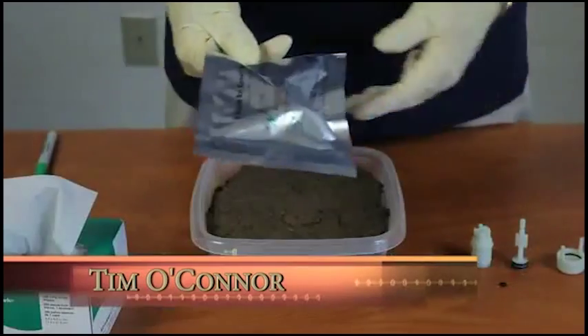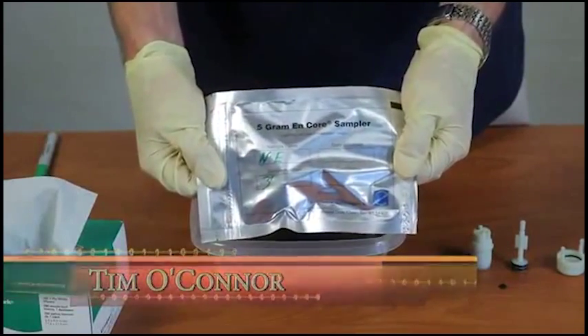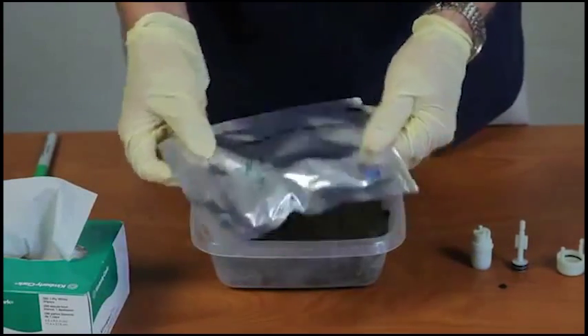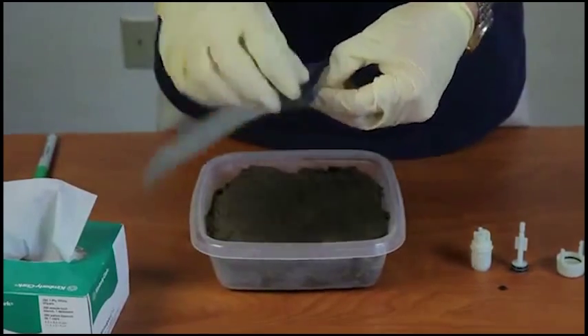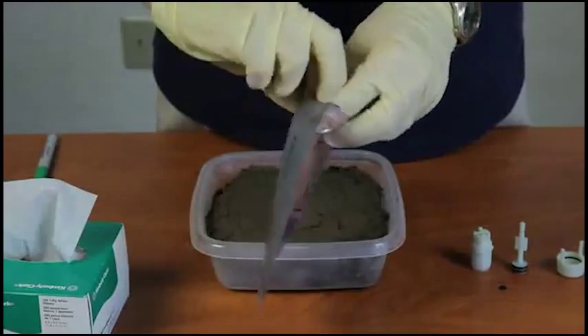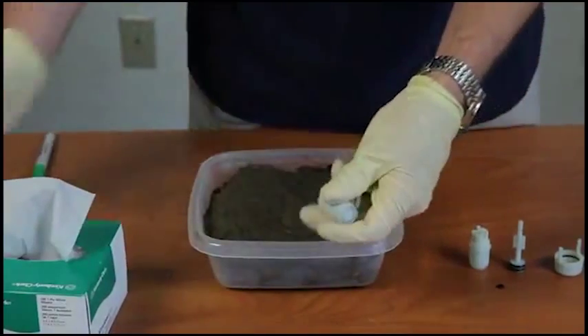My name is Tim O'Connor. This is the NCORE Sampler. You'll want to have your sample bag labeled with the appropriate sampling site. There's a Ziploc bag. Take the sampler out.